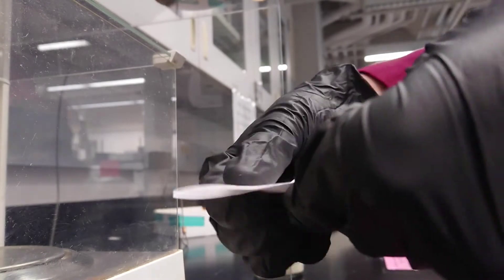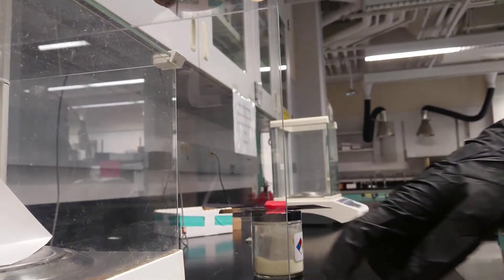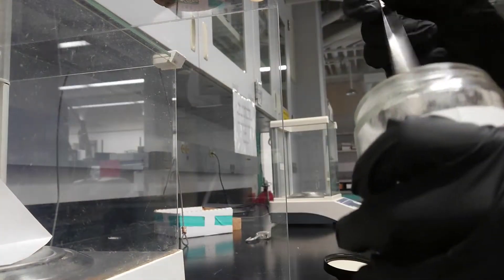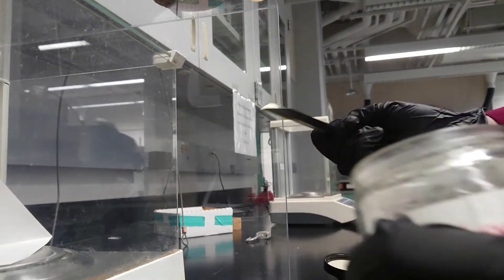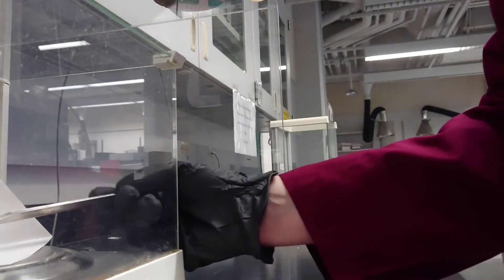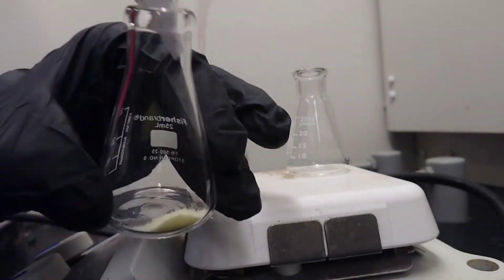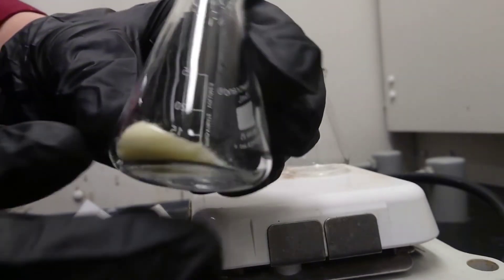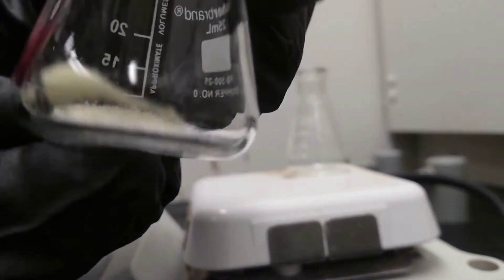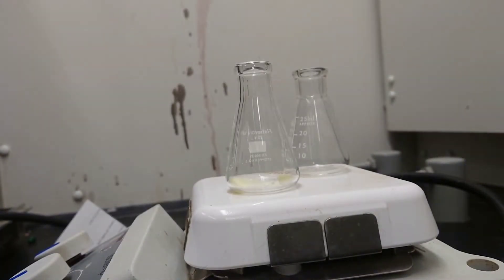Measure and record the mass of the sample that is going to be recrystallized. Transfer the sample to an Erlenmeyer flask, then add several boiling stones.